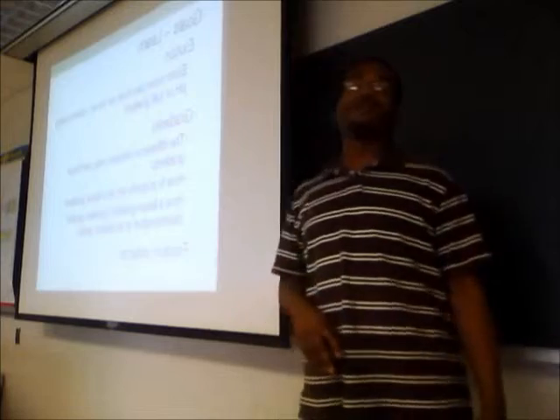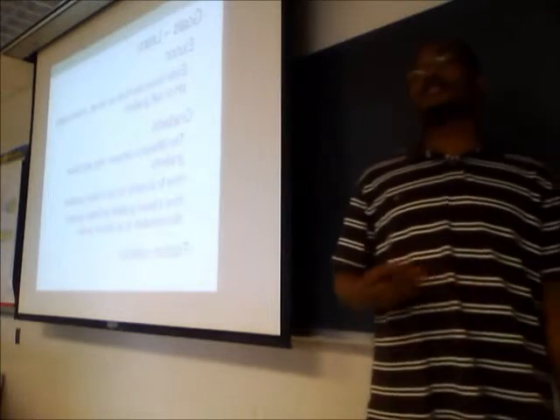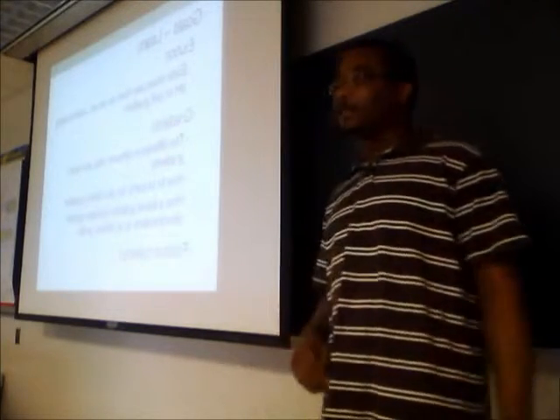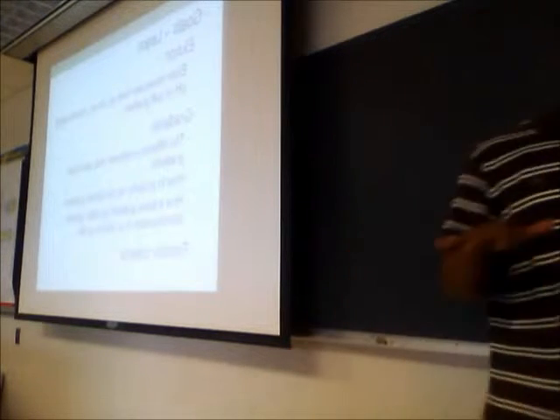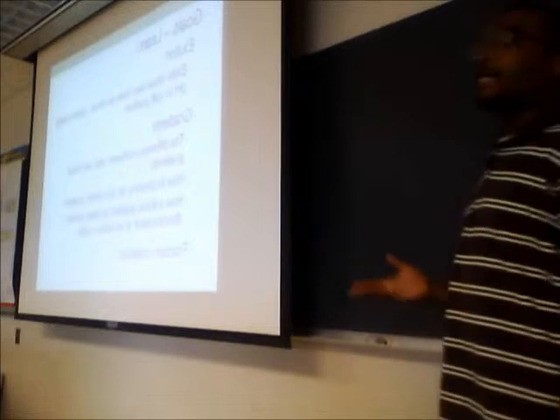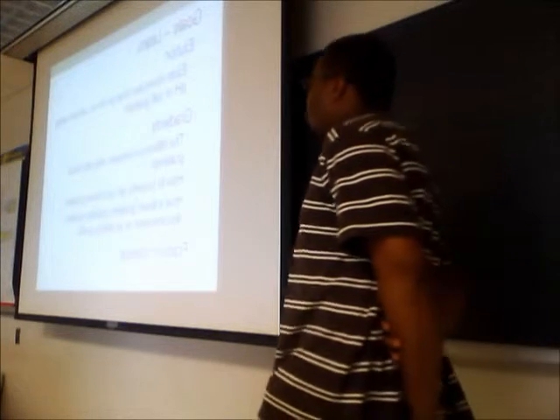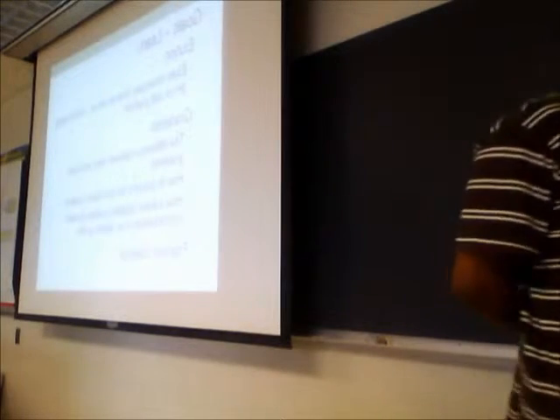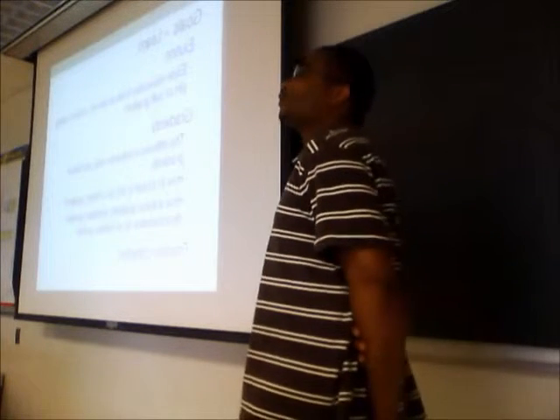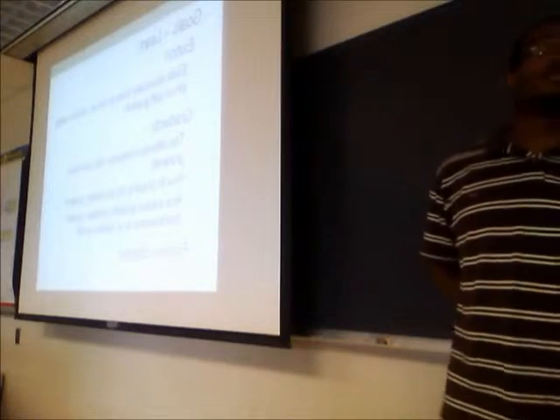You have two types of gradients that you can work with. You can either work with a stepwise gradient or a linear gradient. The difference between the stepwise and linear gradient is the step uses maybe 3 or 4 different concentrations of salt with which they're eluting. And the linear gradient provides a greater discrimination in the elution profile, meaning that you can separate more of these proteins with a linear gradient more so than a stepwise gradient. And we're also going to learn how to properly use a fraction collector.